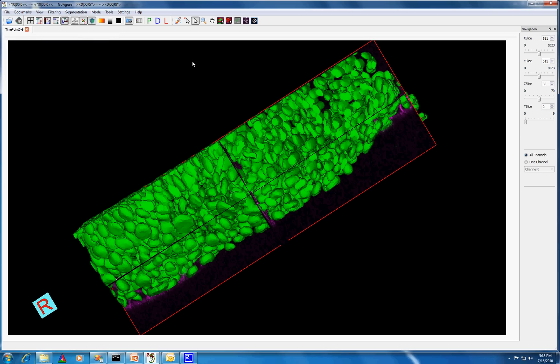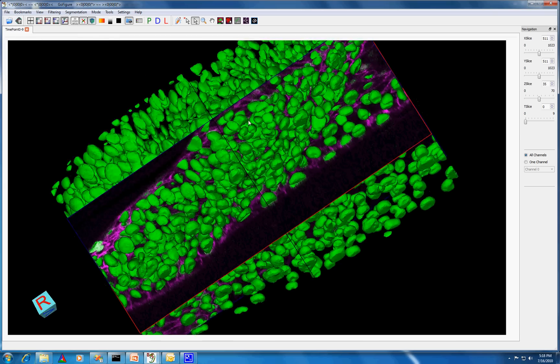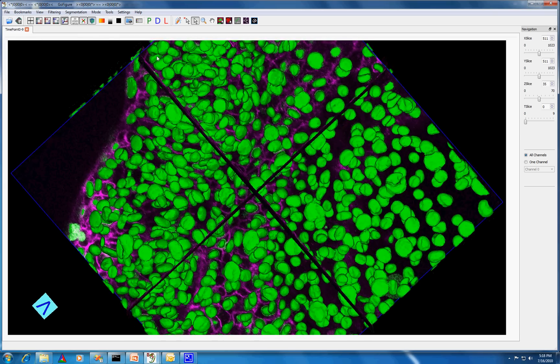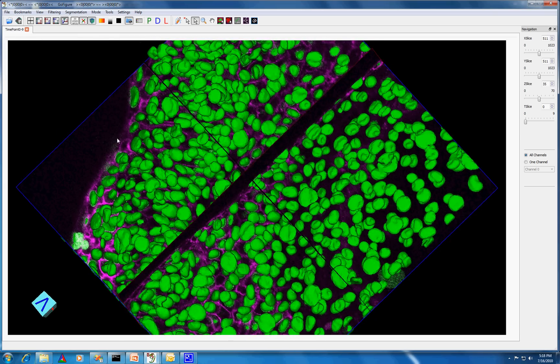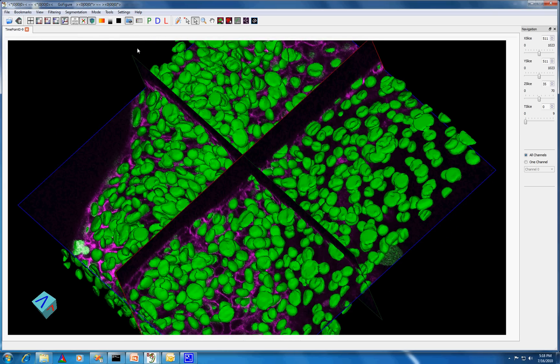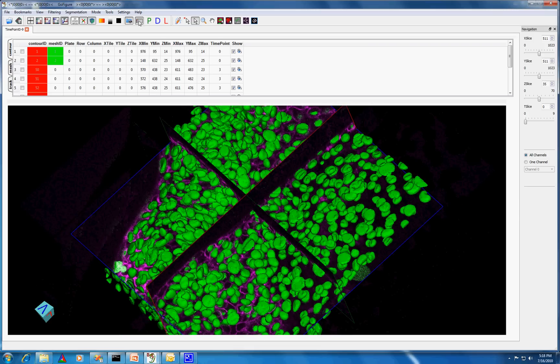Here, we're seeing a 3D rendering of 2,000 meshes that we've imported. Next, let's check out the Table Widget feature.